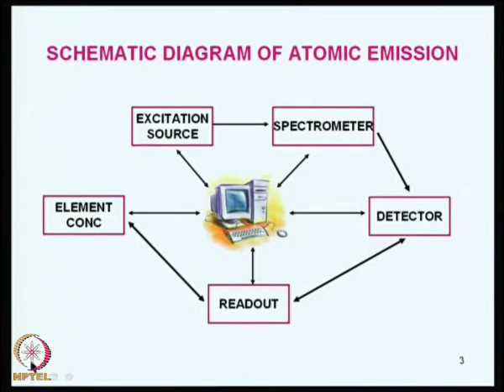And the measurement of the electromagnetic radiation emitted by the atoms, ions and isotopes can be accomplished by using suitable optics, which also permits the concentration determination. That means it gives us a good analytical technique by measuring the characteristic spectra of the atoms when they are exposed to very high energy levels. That is what we consider as ICP AES, one of the techniques.